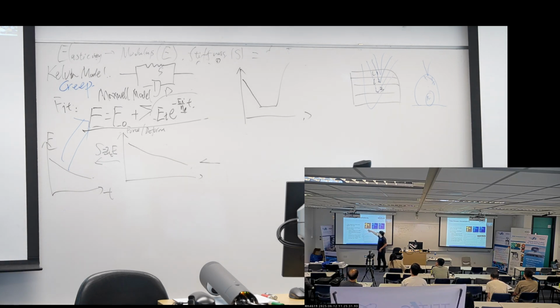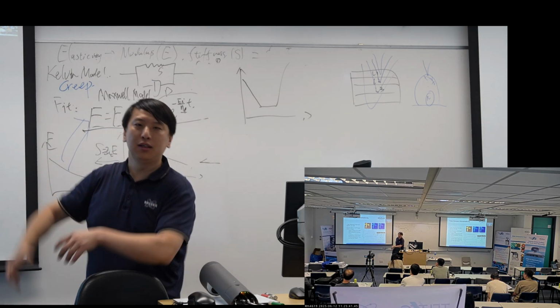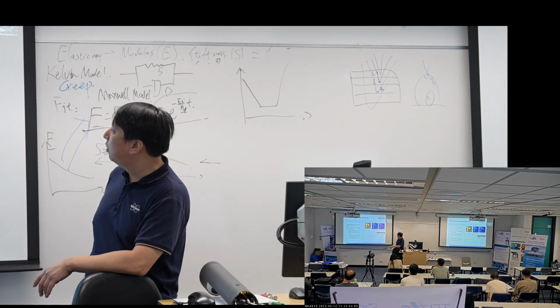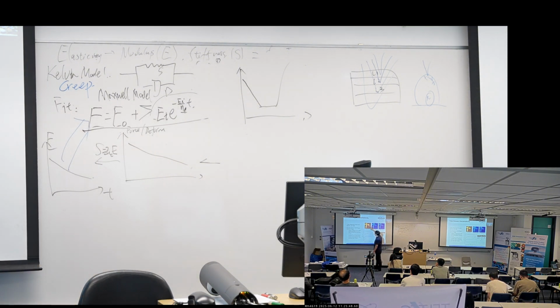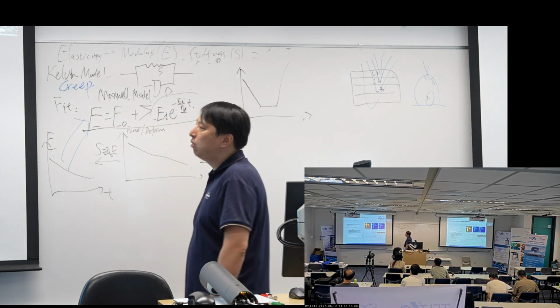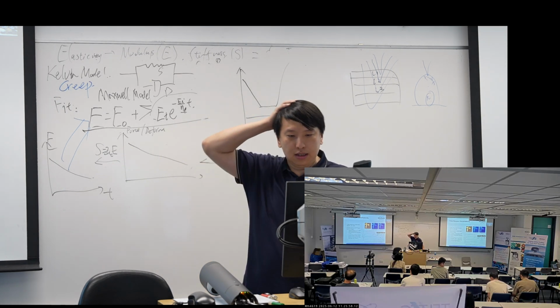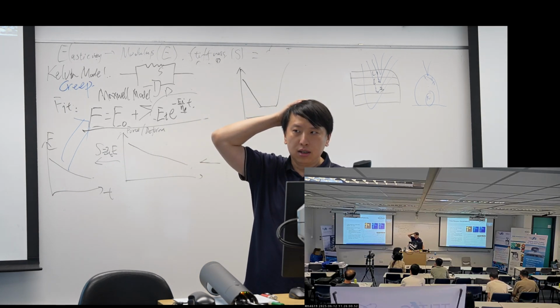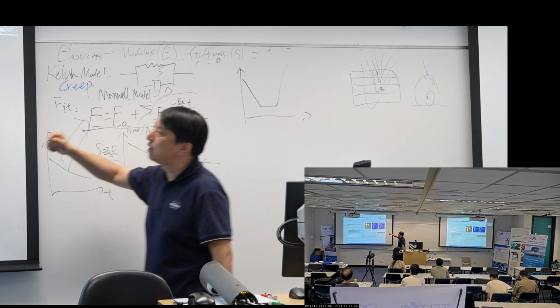He has E. coli, some bacteria, and put it on the substrates. It's not polystyrene, I'm sorry. It's on glass. It's on our glass vials. And on these glass vials, he is doing, let me think, what is he doing? Hold force. Yes, he's doing the correct thing.